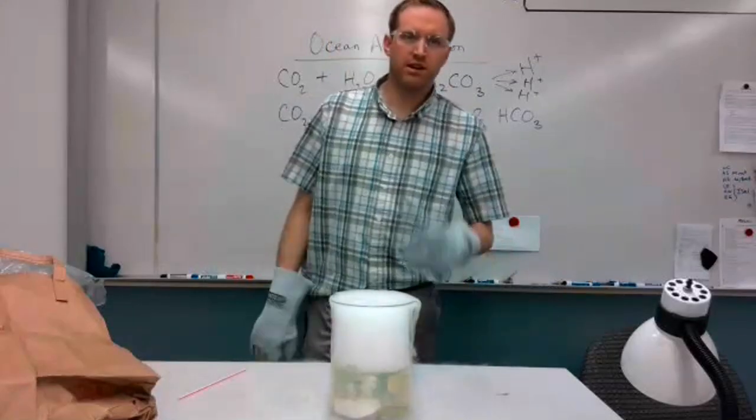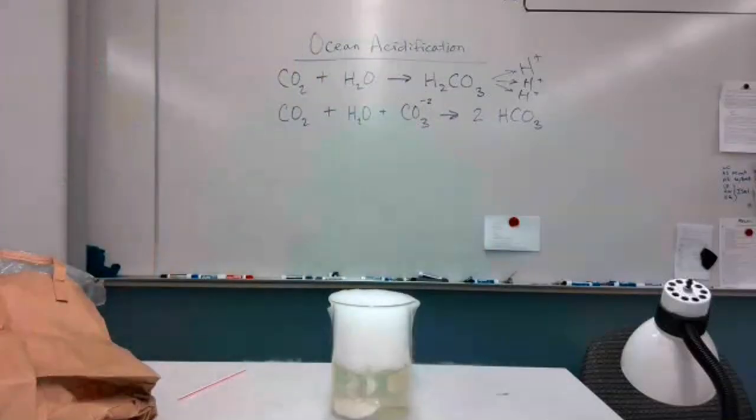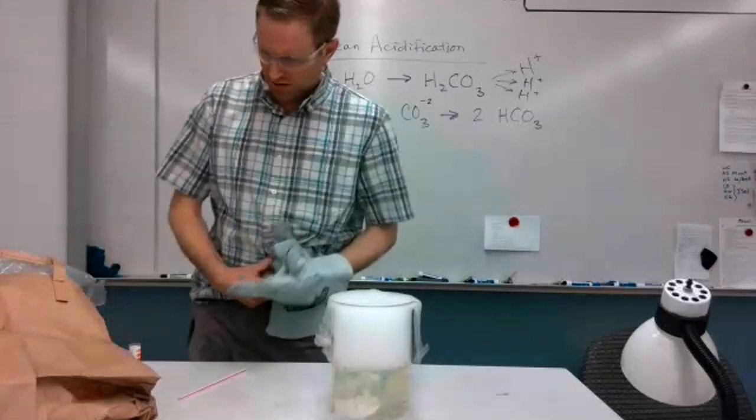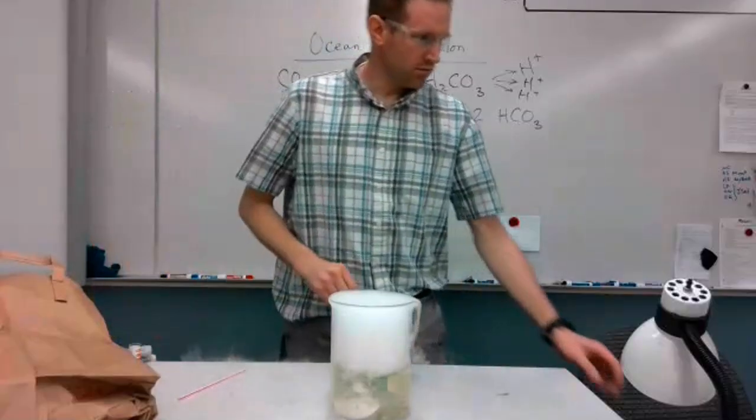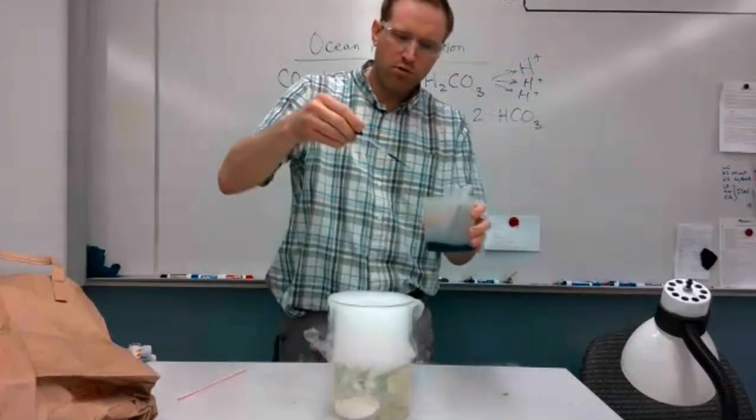I'm going to be right back. I'm going to get some pH paper. I'm just curious what will happen if we add a little bit more of the indicator.